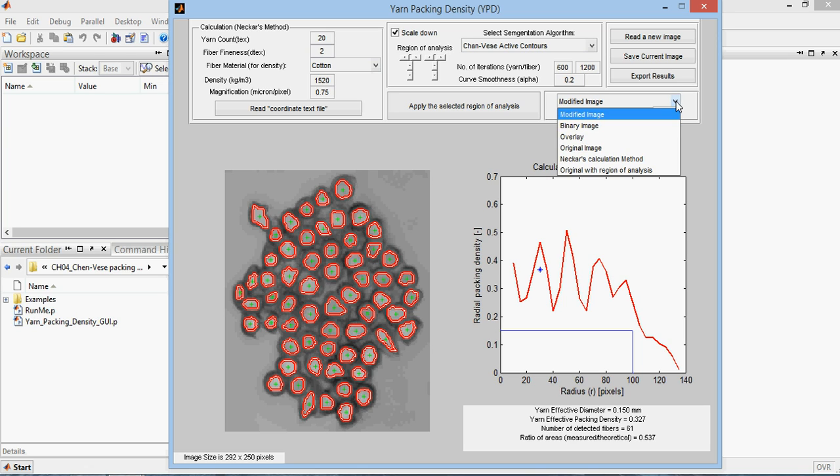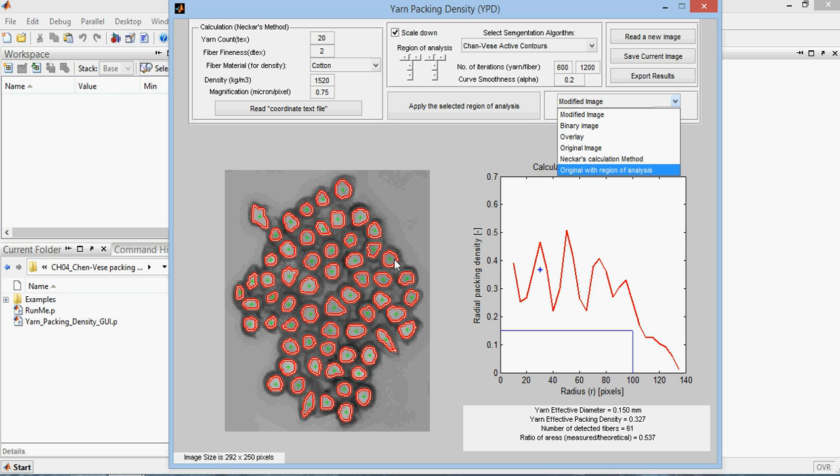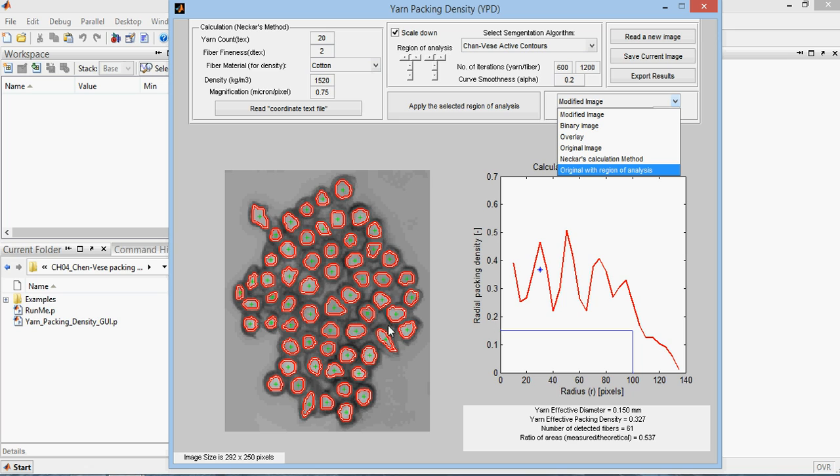This makes some difference between the traditional method of calculating the packing density, where a human operator starts to look at the image and assign the center of each fiber manually. In fact, this method is also included here in this program. The calculation method. The way it works is by replacing each fiber here with, regardless of its original diameter and how the cross sectional shape of the fiber looks like, it will replace each fiber with a cylinder.